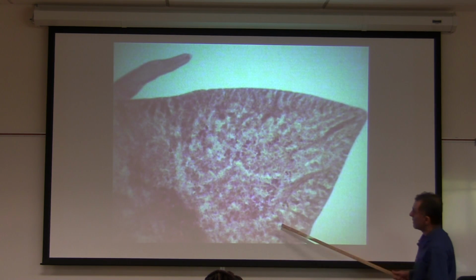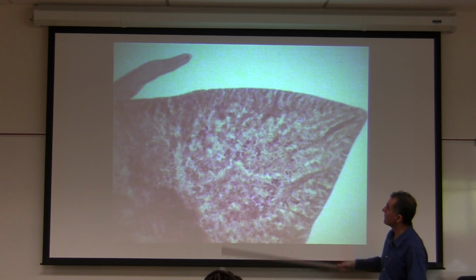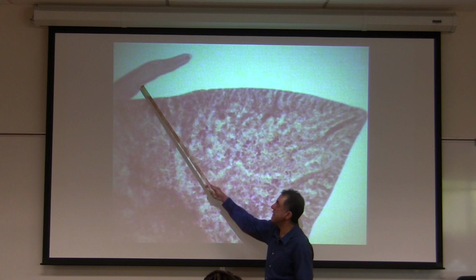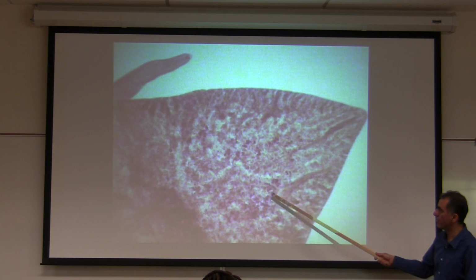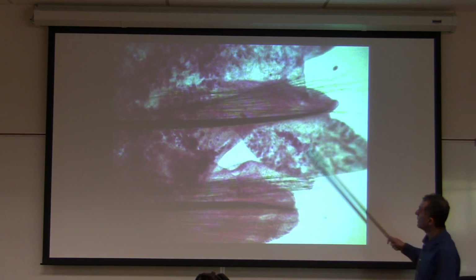What is the name of the structure? Notopodium. This is not a podium, but if I ask what is the whole entire slide, because you have a little bit of cirrus there, it's probably parapodium, but which part of parapodium? This is not a podium. I should have, here we go.